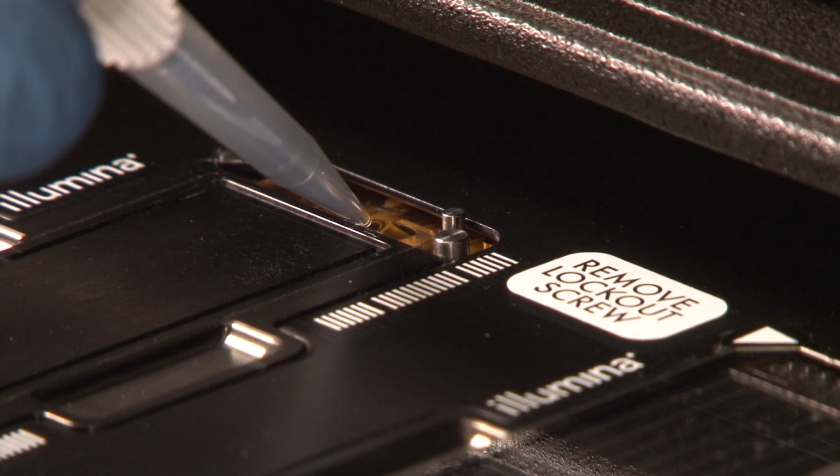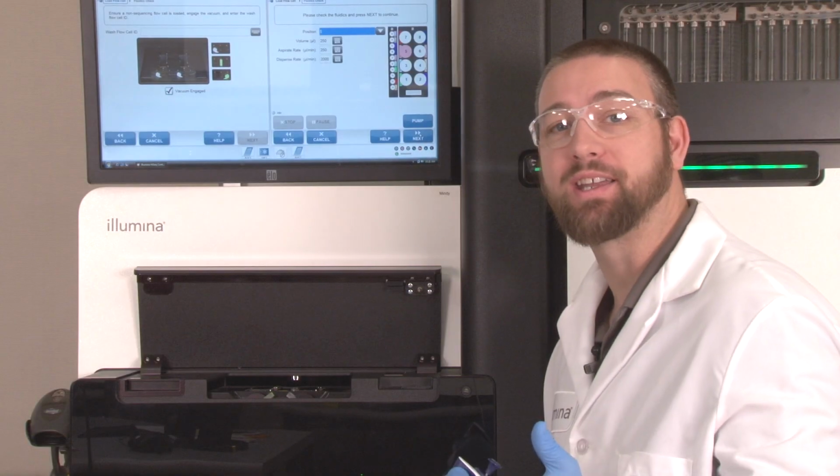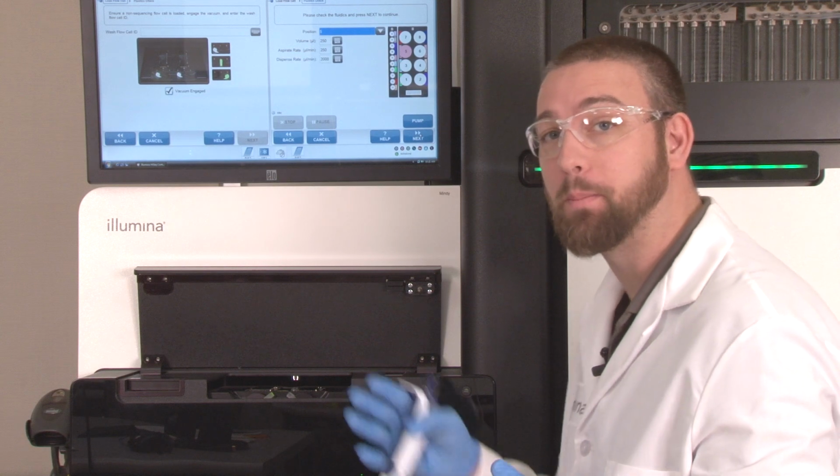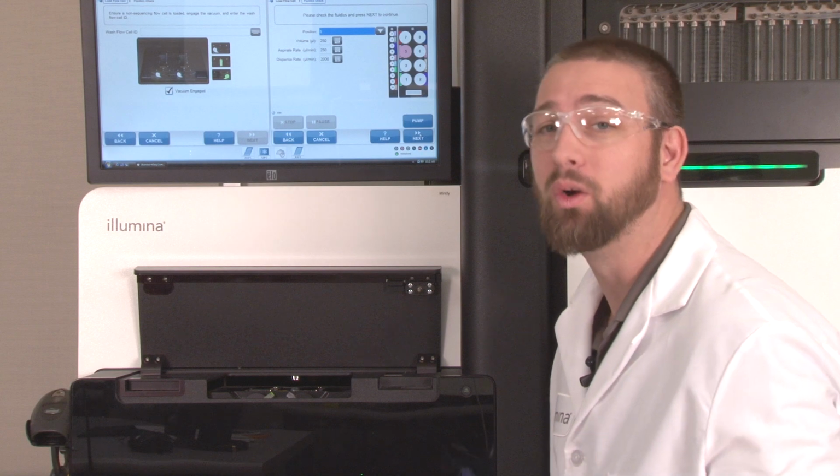To do this, remove the flow cell and gaskets and pipette the warm water into the outlet manifold well. The outlet manifold can only hold about 100 microliters in the shallow well, so be sure to add warm water continuously as it is drained. This process allows you to run water quickly through the back portion of the fluidics without introducing variables such as the flow cell or gaskets.